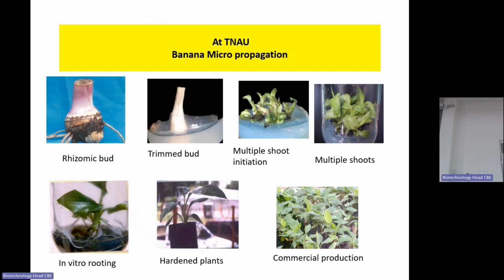Which batch did this tissue culture? You get A batch there. ID number 6, 7. So what did you do before putting onto the medium? Ascorbic acid. Why ascorbic acid? Okay, browning. Now, what are we talking about?